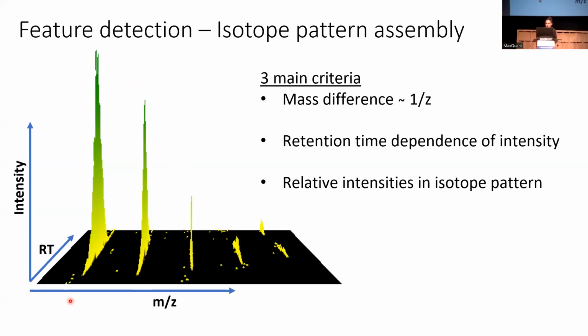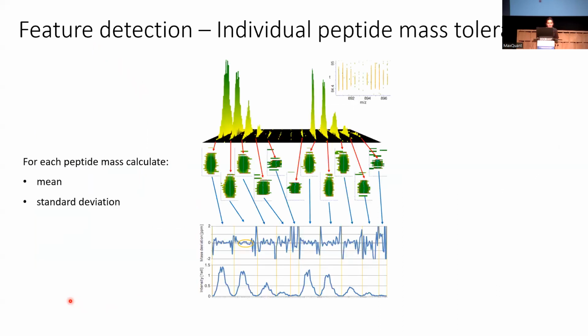So now you can probably tell that for one peptide, I have so many measurements of the mass. Not only in the retention time, but also I have a lot of 3D features in the isotope pattern. And this will help us a lot.